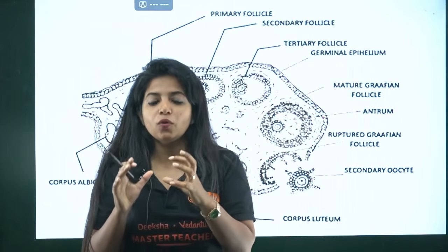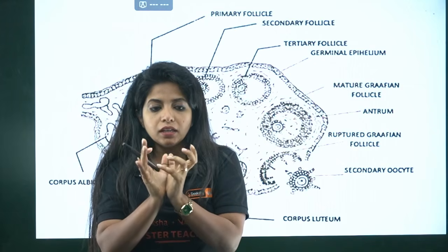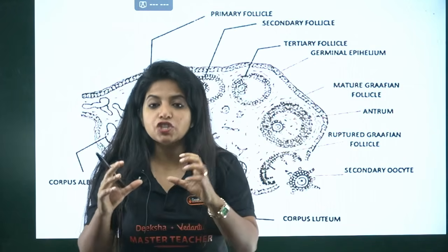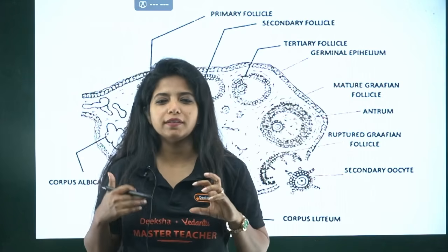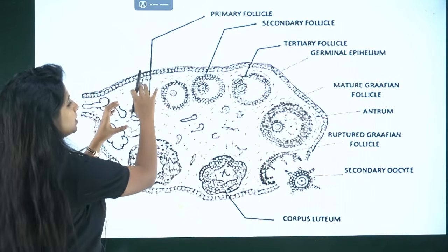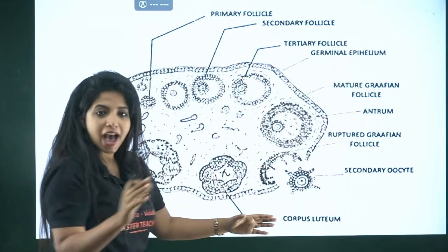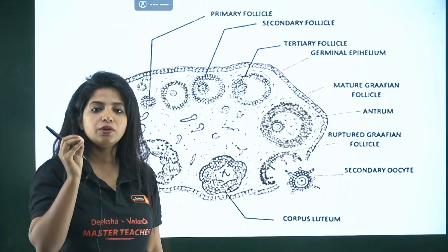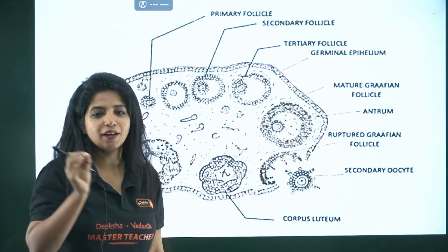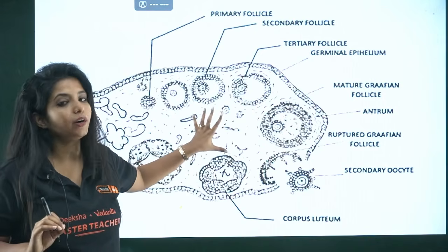So basically over here, you find that the egg is in the developmental stage, and they are covered by some granulosa cells, which is why you call them follicles. So these follicles are basically getting mature. And inside that, you have the different stages of primary oocyte, secondary oocyte, and everything out there. Okay. So this is happening in what? The cortex region, and this is what? The medulla.